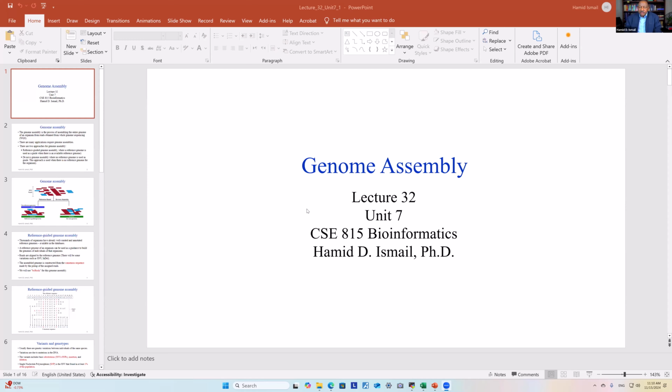But we will get the reads, and then we follow all those steps until the point of read mapping that we discussed last time. Okay, and I gave you 2 assignments. So from read mapping to a reference genome, then we will continue to assemble the genome, and we'll show you how to do that in a different way.